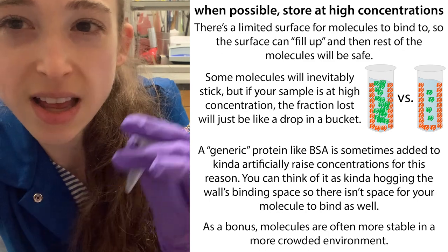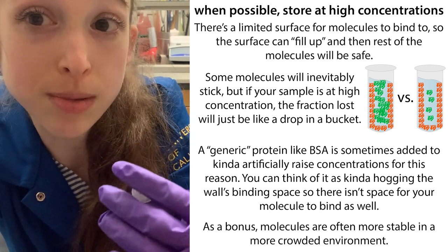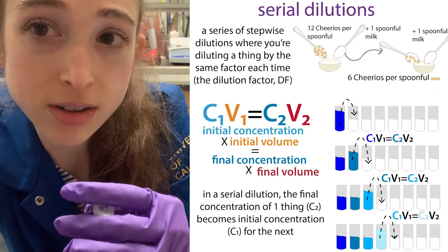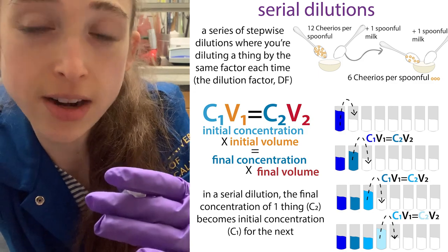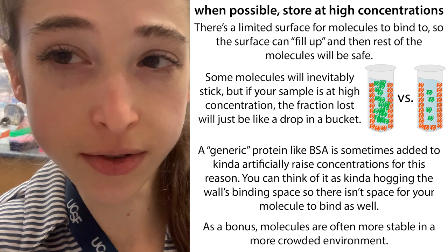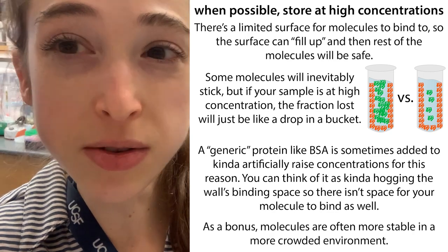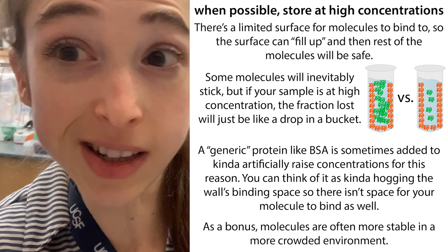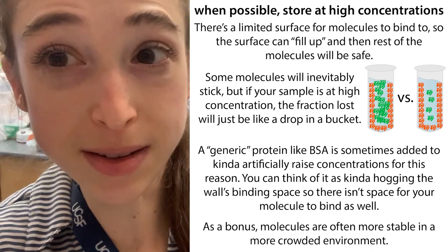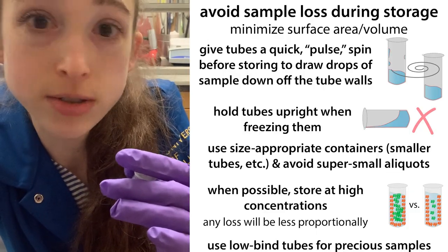Various reasons mean that more concentrated solutions tend to be more stable. So it's better to keep things frozen at a higher concentration and then dilute them out later with serial dilutions if necessary. One last thing: when you go to actually use your sample, be sure to mix it first — pipette it up and down a few times — especially if it's been frozen, as the concentration can become uneven in different parts of the solution. So make sure you mix it before you use it.